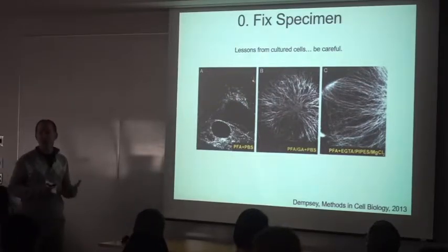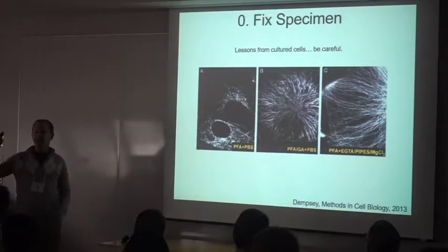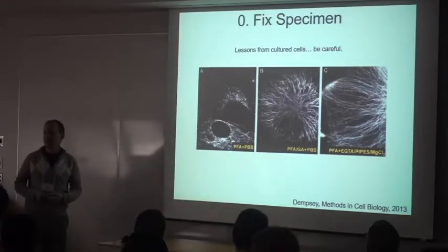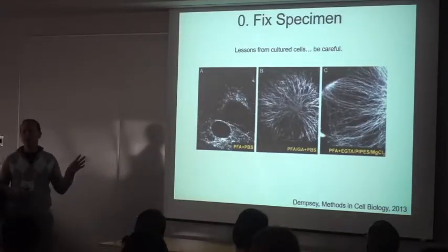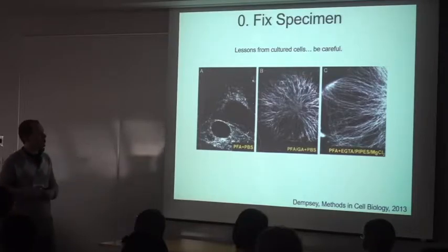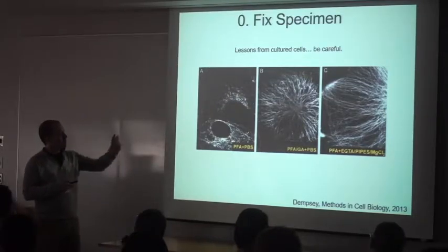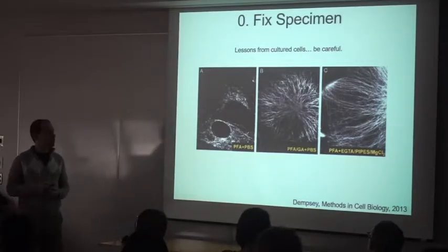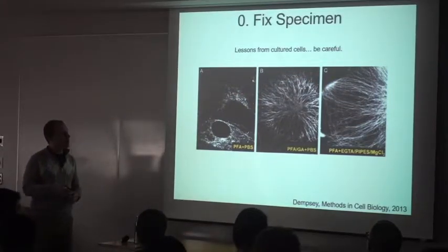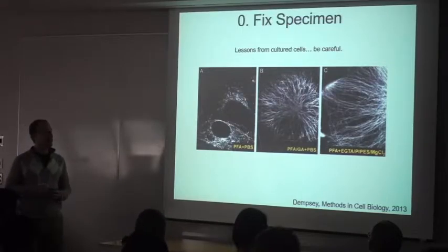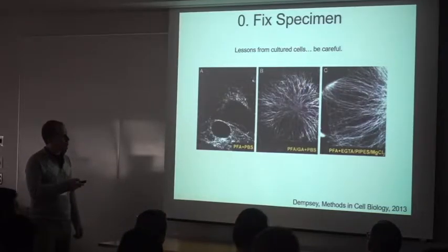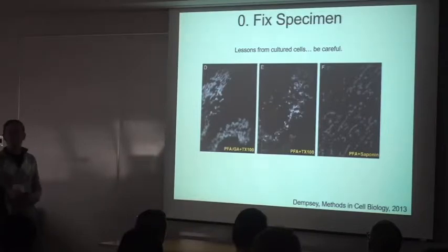I should mention glutaraldehyde masks epitopes. How many of you have struggled with that? You've got a great antibody that works for PFA and then you switch to GA, all of a sudden all bets are off. I think the people who generate antibodies don't think about that as much as they could. There's actually a trick - there's a buffer that can keep microtubules happy and allow the milder fixation.